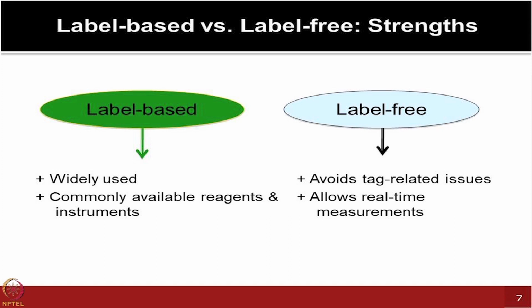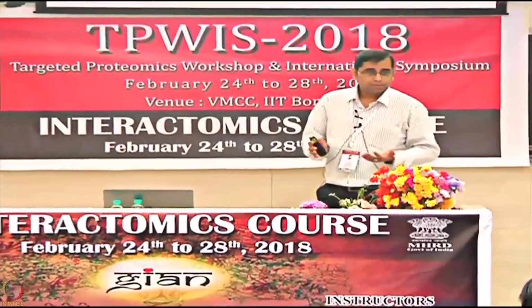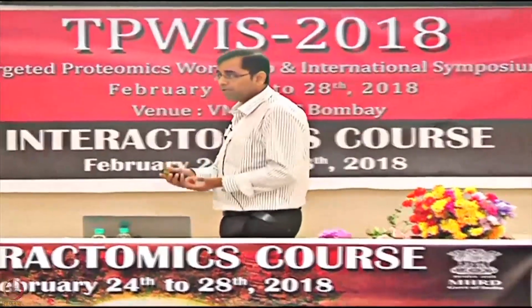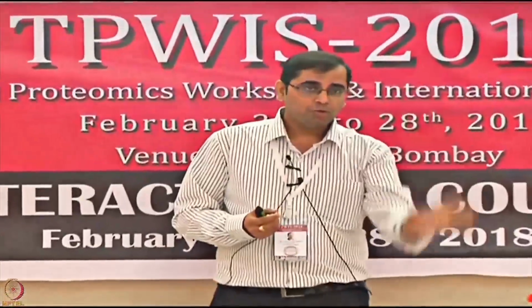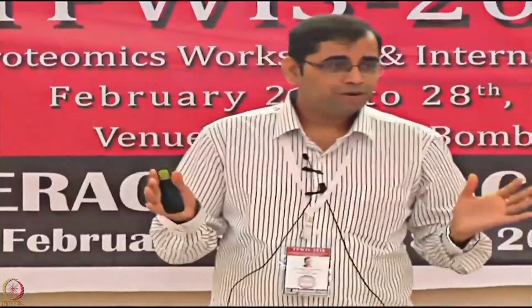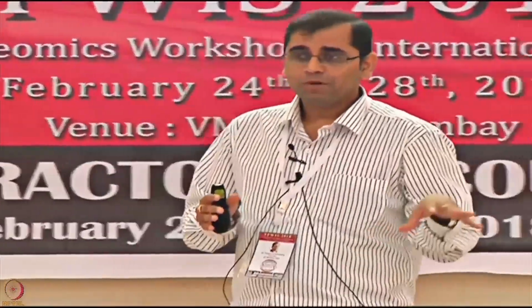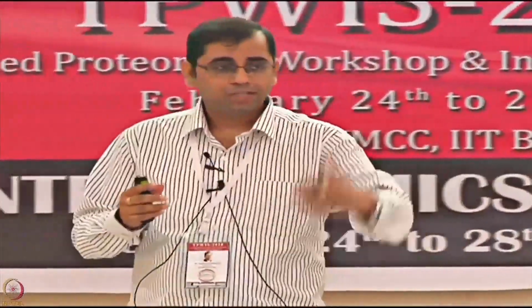And most importantly, you are actually monitoring the biomolecular interactions in a real time manner, and that's pretty powerful, because all the protein microarray technologies are great, but it takes a whole day to do the experiment, sometimes even longer if you are doing blocking and all. At the end of the day, only then you are relying on the scanner to show you whether your spots are lighting up or not, or you see some sort of huge background, you see your controls did not work out, and you're hugely disappointed. But you had literally no control as the experiment progressed the whole day.